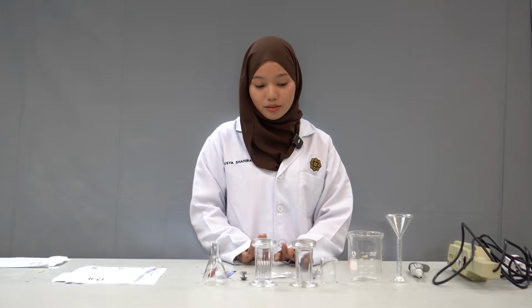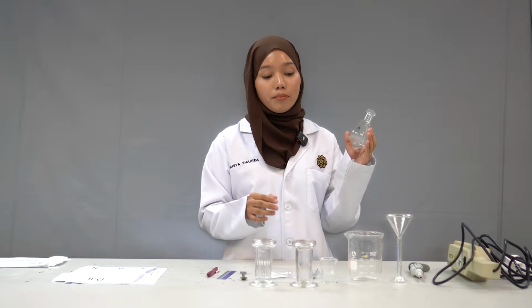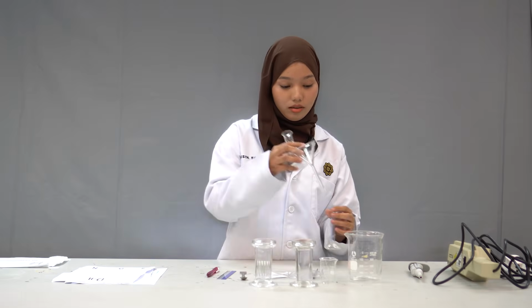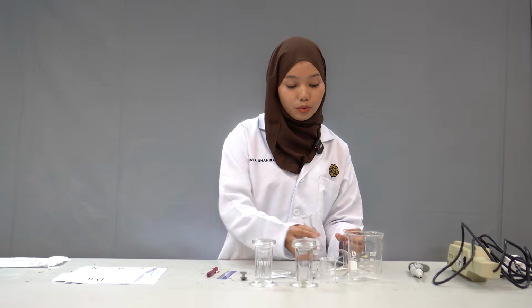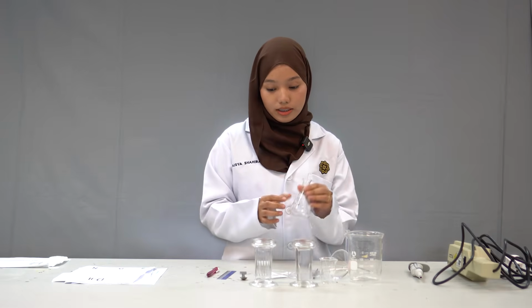Next, we prepare 2 developing solvents by placing 5 ml of hexane ethanol with ratio 9 to 1 into the first flask, and 5 ml of dichloromethane hexane with ratio 9 to 1 into the second flask.